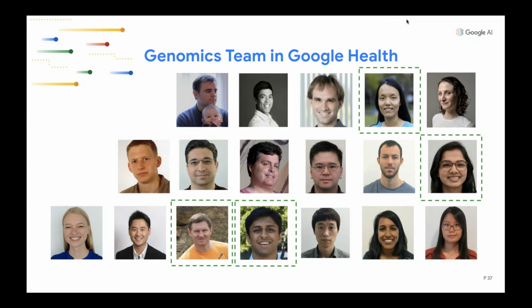Okay, thank you. And I know Andrew does have to leave in a minute, so I'm just going to group some of these questions together and make my own interpretation. But broadly, what are the prospects for using DeepVariant on unusual organisms and organisms that are more than diploid, and for cases where we have population studies?